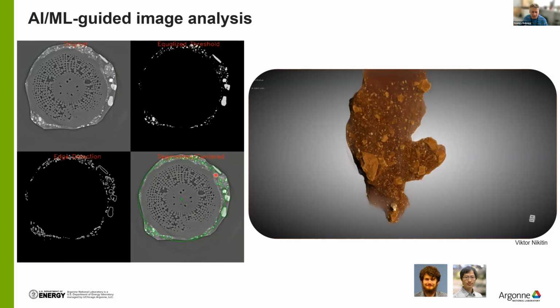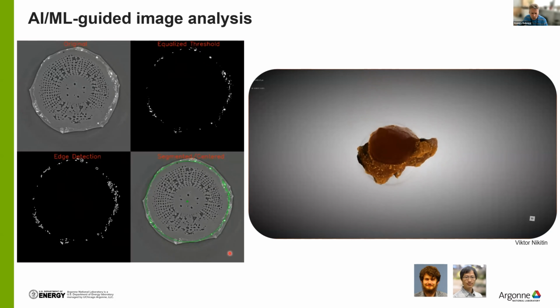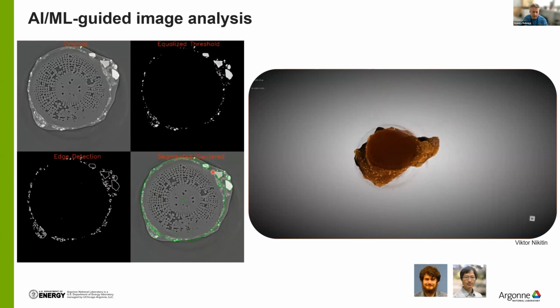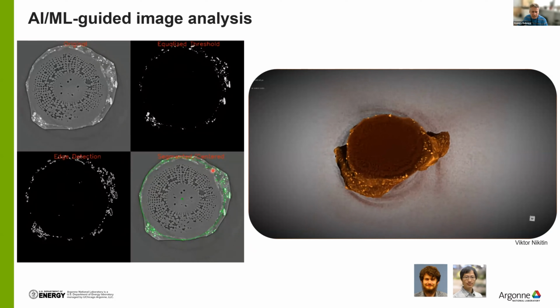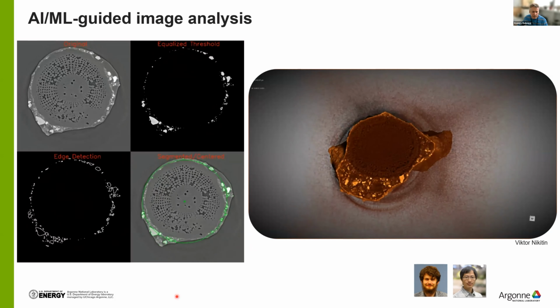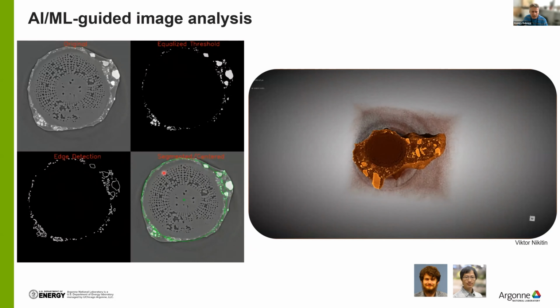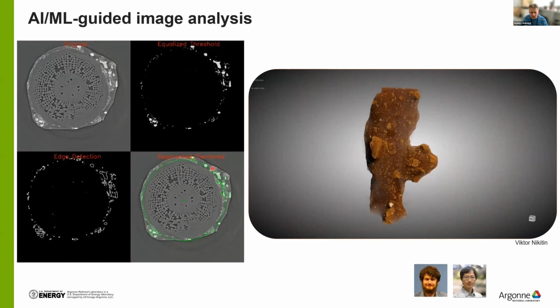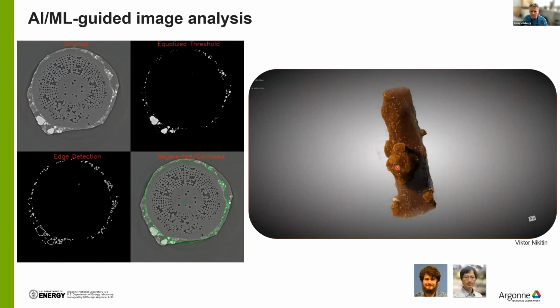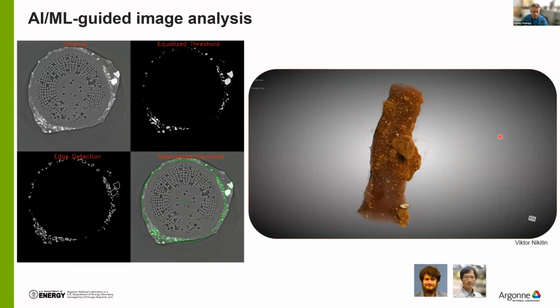porosity as well as the connections of those pores, because as Ken pointed out to me the other day, roots will basically change that porosity around them, and that's where all the activity takes place. So it will be very important for us to enumerate that computationally.